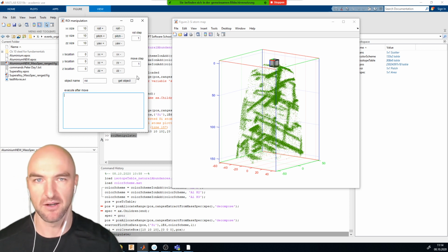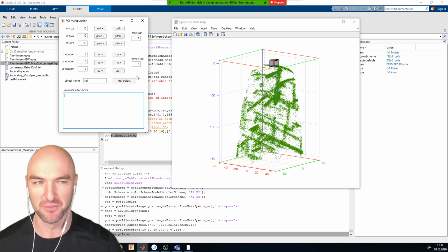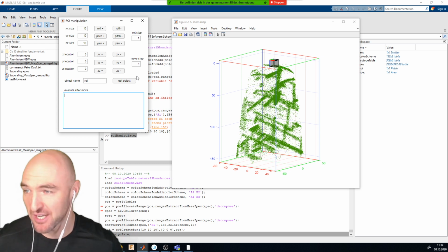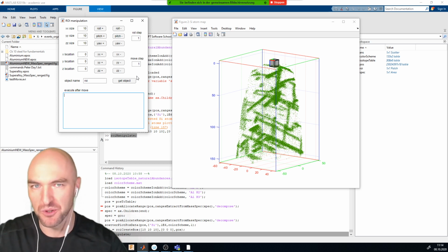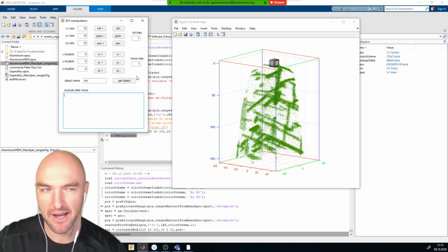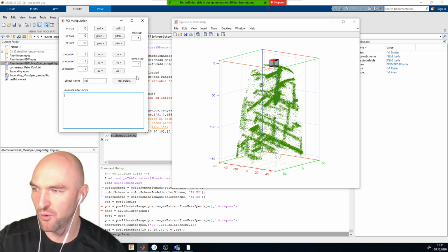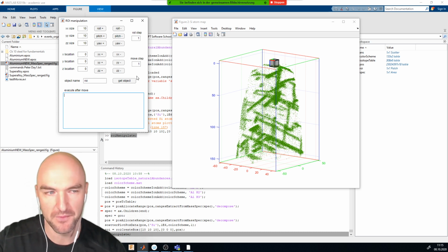How is this related to Andrew Breen's and Vic's toolbox? I have no idea because I don't know Andrew's toolbox, and if Andrew has some cool code in that area, I want to see it. And actually, some of the code that we are using for region of interest here has already been taken up by Konstantinos Hatzoglu, who is at NTNU now.